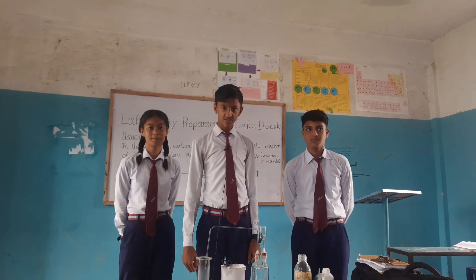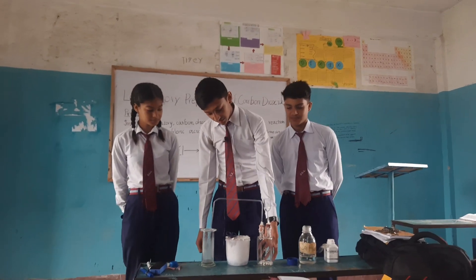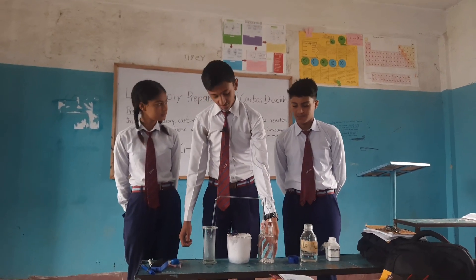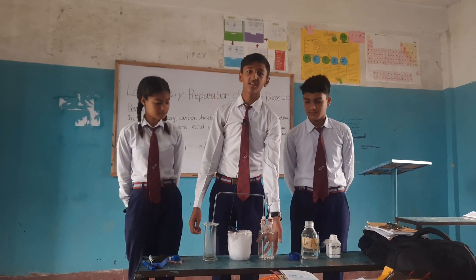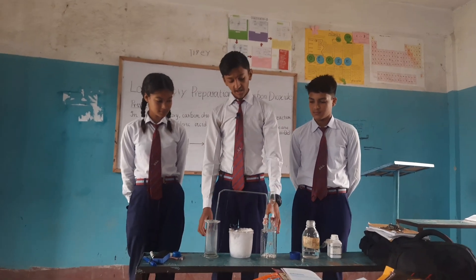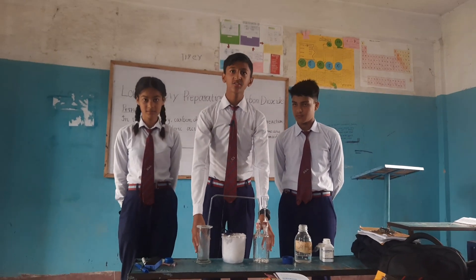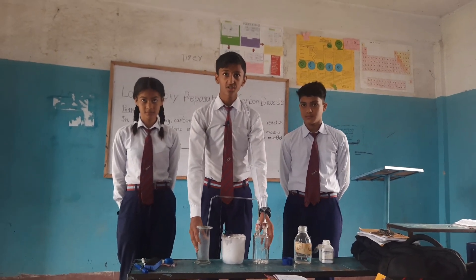Now it's time for the procedure. We have kept some limestone in the Wolf's bottle and the apparatus are arranged as shown in the video.